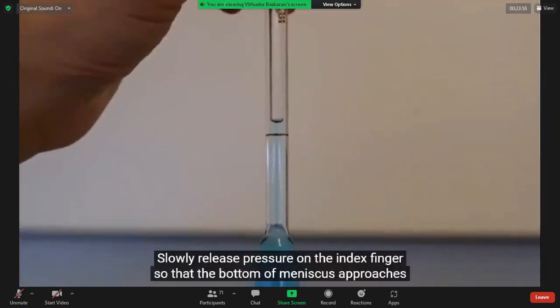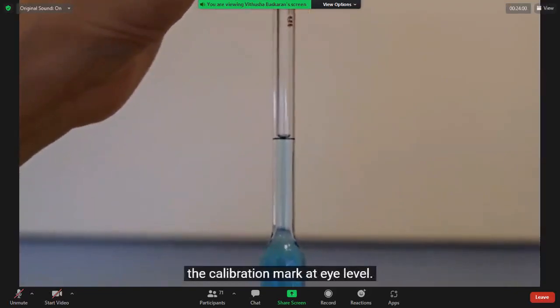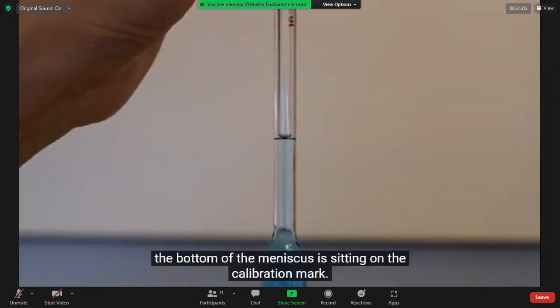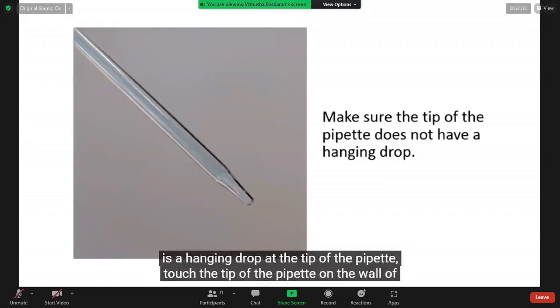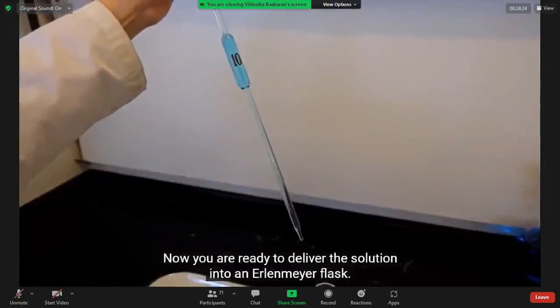Slowly release pressure on the index finger so that the bottom of the meniscus approaches the calibration mark at eye level. At the mark, apply pressure on the index finger to stop the level of the solution such that the bottom of the meniscus is sitting on the calibration mark. Inspect the tip of the pipette to make sure that it doesn't have a hanging drop. If there is a hanging drop at the tip of the pipette, touch the tip of the pipette on the wall of the beaker and recheck to ensure that the position of the meniscus has not changed.